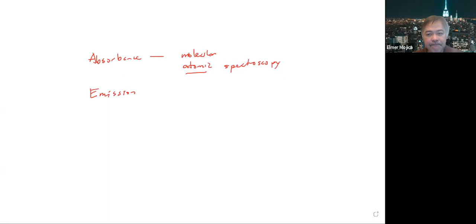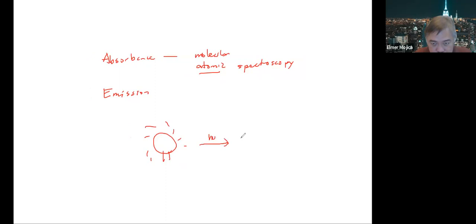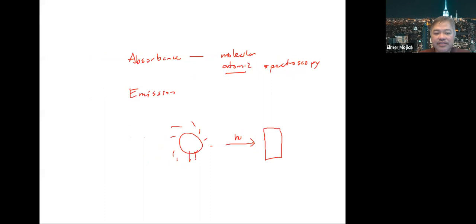Because if you're going to look at what really is happening, right? So usually, if you're going to look at this, you have what? The light source. And then what happens to the light source? Okay. So you put an incident light on it. So what can happen when you have a sample in the cuvette? What happened now? So something comes out. That's the absorbance. Now, what if you do it like this? You look at it at this angle. What do you call that?